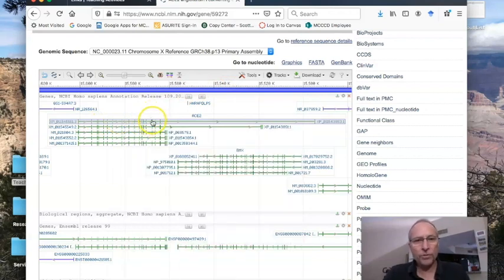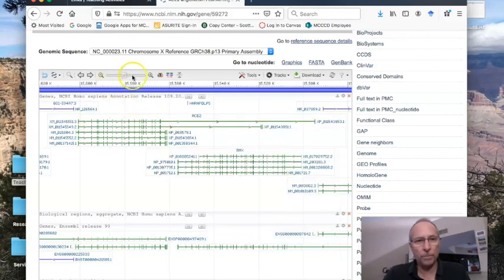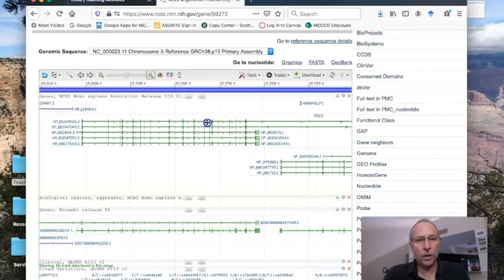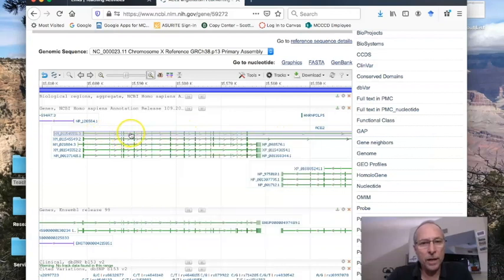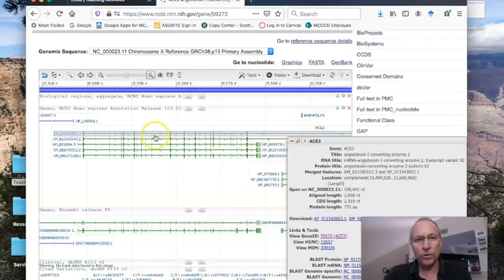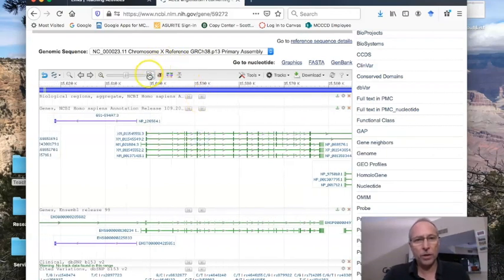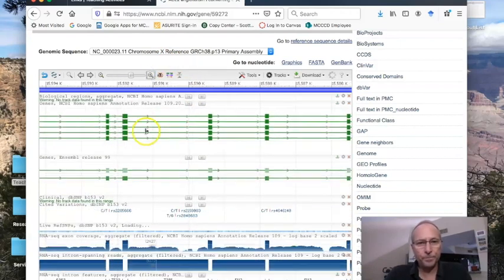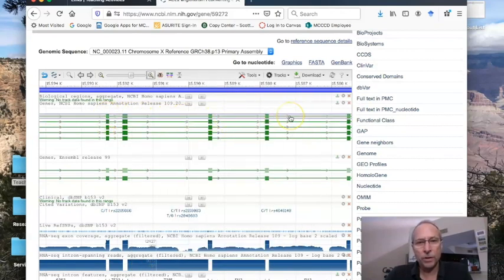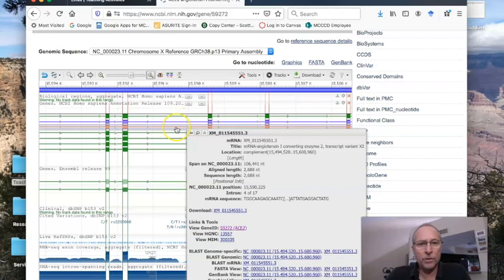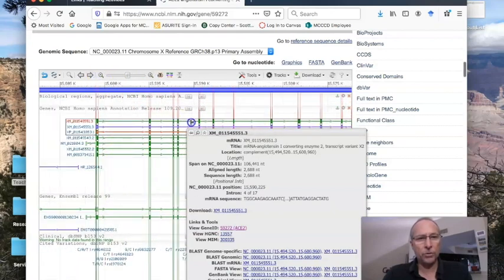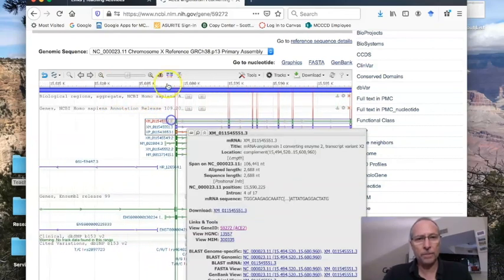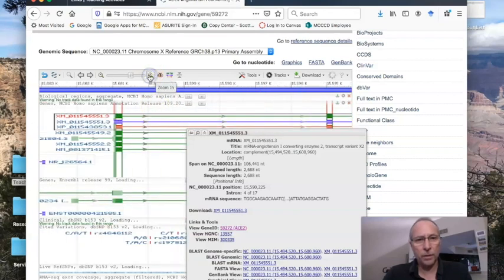I want to focus on the X2 variant, the one at the top, the longer one. Just like before, I'm going to come in here and start to zoom in on this. Notice, it looks like everything in here is intron. Remember the thin lines are the introns? But see these little tiny things right here, these thick ones? Those are the exons. The introns are huge. They make up the majority of this gene. All of this stuff here is intron. The only part of it that's exon are these little thin parts. Let me zoom in so you can see what I'm talking about. I'm going to keep zooming, and these exons are going to get bigger. Here are the exons. That's an exon right there. There's another exon right there, but the rest of this stuff is intron. If we click on this, it'll do what it did before and give us the messenger RNA for that sequence and the protein sequence. I'm going to zoom out a little bit because I want to go all the way back to the first exon. I'm going to scroll this back all the way to the first exon. I'm going to put this in the middle so we can see it. Now I start to zoom back up right here on this first exon.